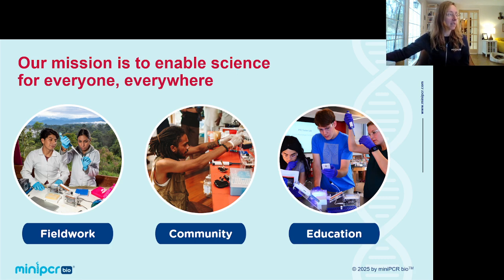So we have scientists who bring our tools into the field to do DNA analysis on site where they're collecting their samples, whether that's in the jungles of the Amazon or on a research vessel traveling the Arctic. We have users who bring our tools into their own homes to pursue their passion projects. So this is a self-taught mycologist. He uses our equipment to identify the mushrooms that he forages for and that he cultivates.